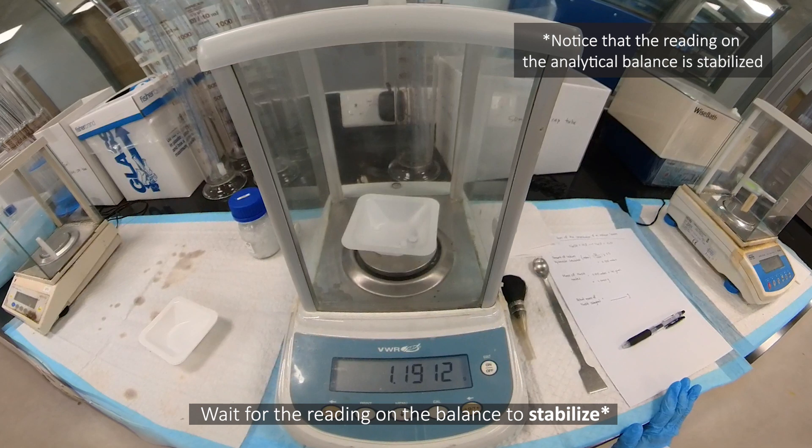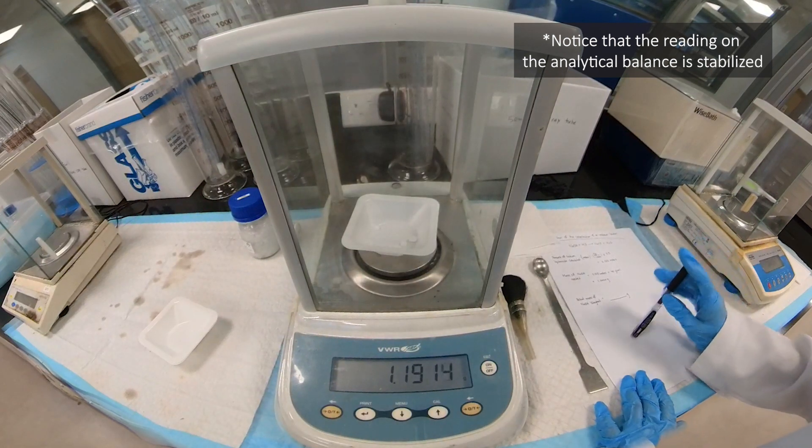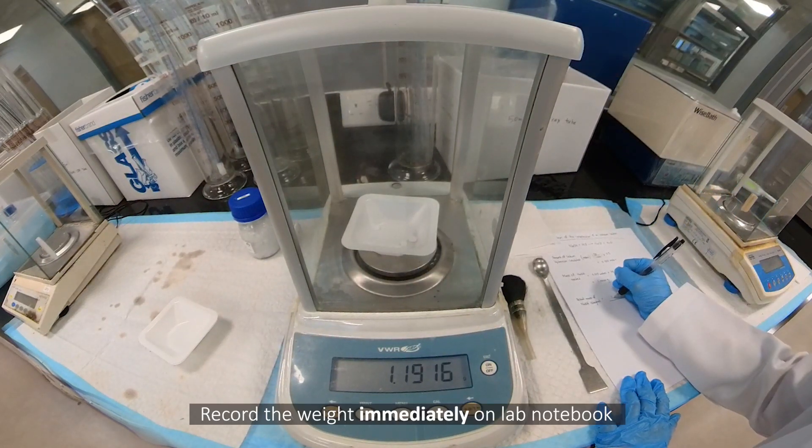Wait for the reading on the balance to stabilize. Record the weight immediately in the lab notebook.